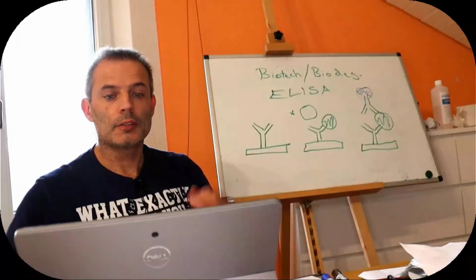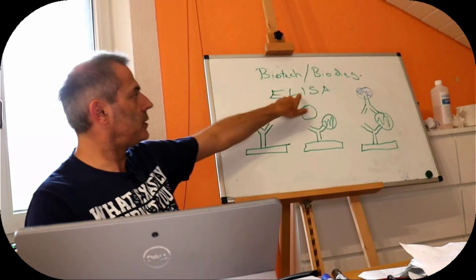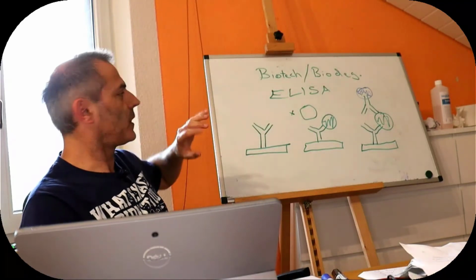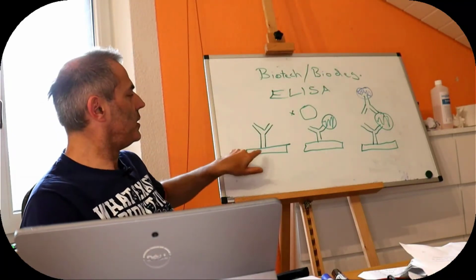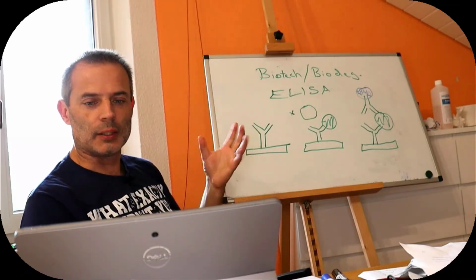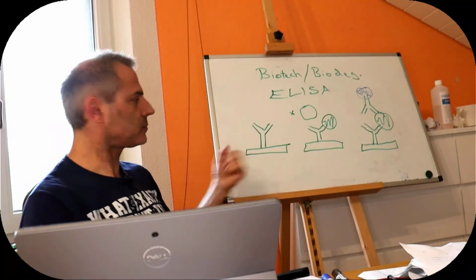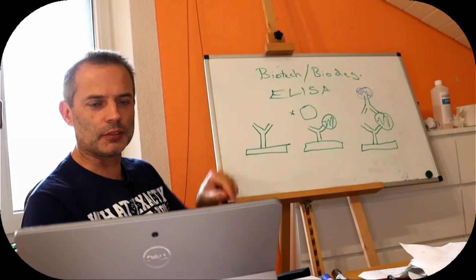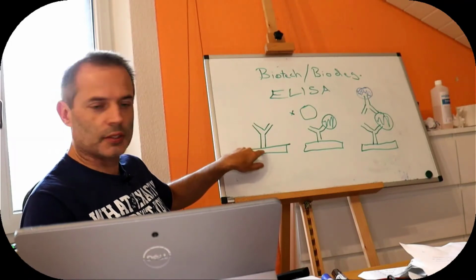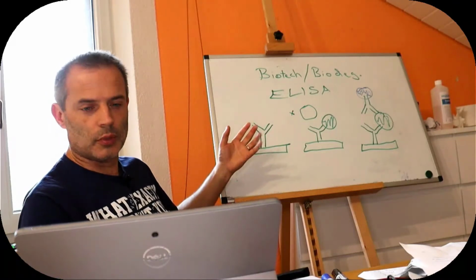So getting on to our main theme of ELISA, which is enzyme-linked immunosorbent assays. Nearly got confused there. We have some kind of surface. It's typically a little well in a plastic plate, a 96 well plate typically. 96 because it's easy to form an array out of them.